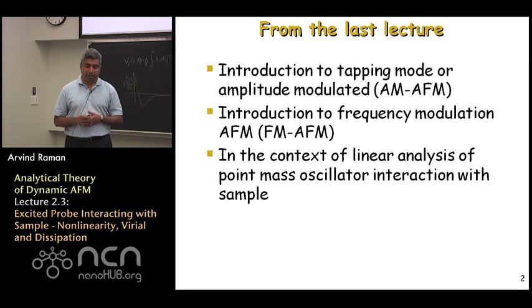We did everything on the basis of linearized theory. In other words, we represented the tip-sample interaction forces by a linearized version, a straight line slope and a simple viscous dashpot.